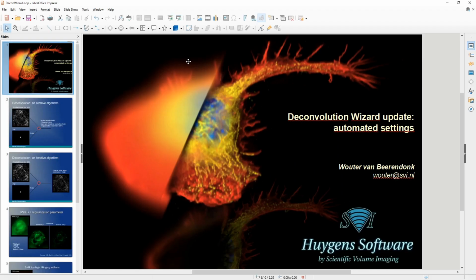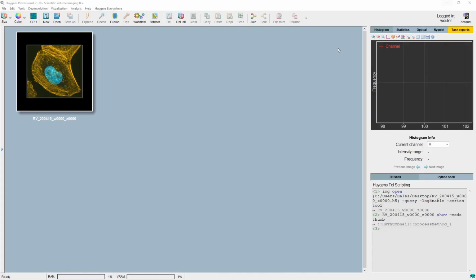I will close the presentation, and I already had the Huygens Professional open, where I will go to the Deconvolution Wizard. The changes applied in the Huygens Professional Decon Wizards are also applied, of course, to the Decon Wizard in the Huygens Essential.